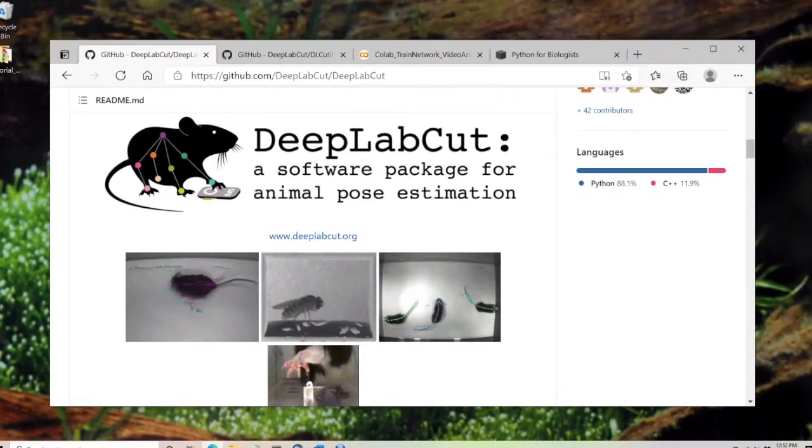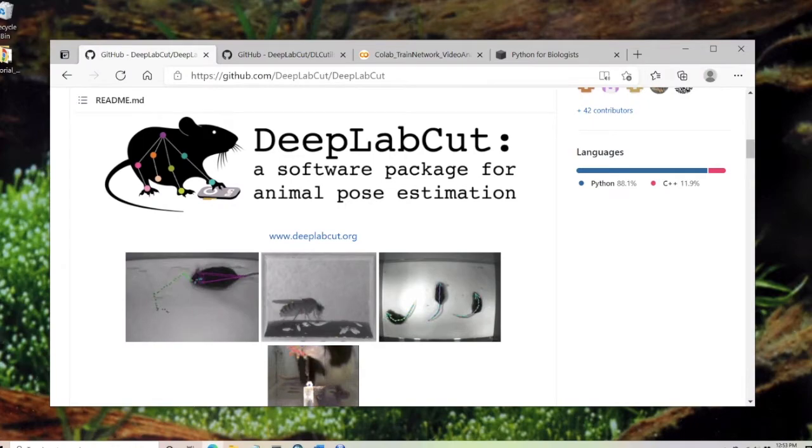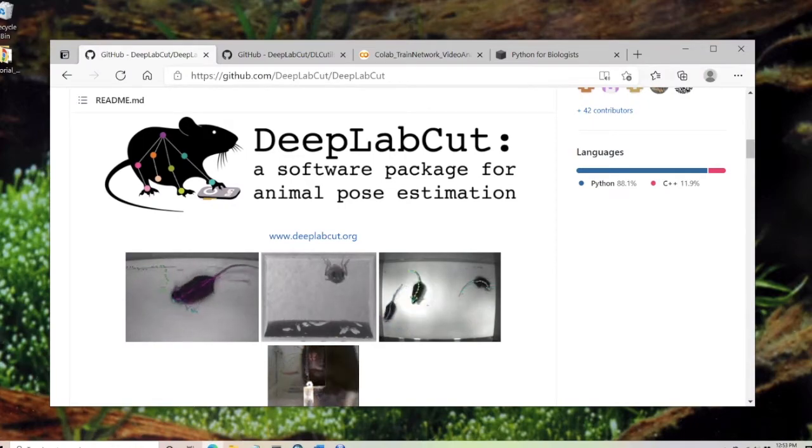Hello, this video is just about getting started with the animal pose estimation software DeepLabCut, specifically for people who aren't very comfortable with programming. I'll just be showing you some helpful resources, going over some basic vocabulary, and then doing a short demo. So if you've never worked with a command line before or just don't feel comfortable diving headfirst into the DeepLabCut documentation, then you may find this video helpful.